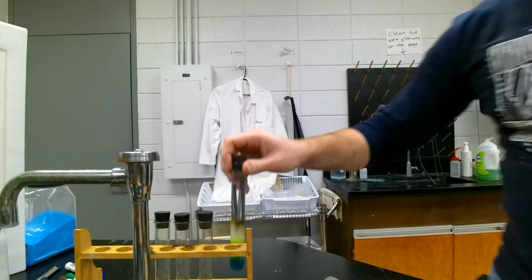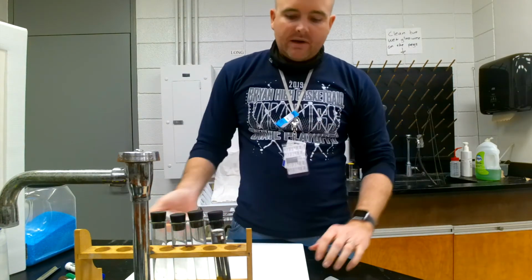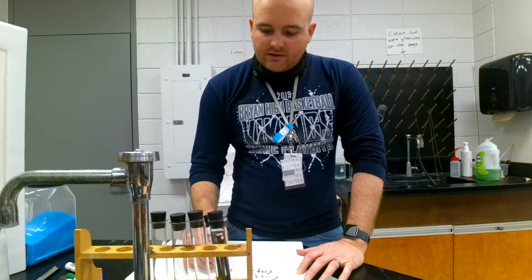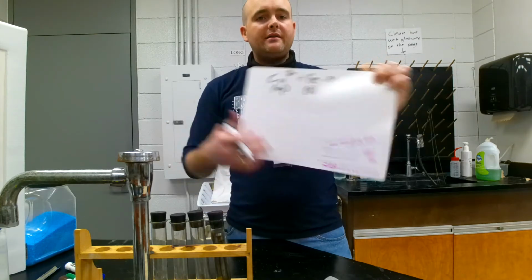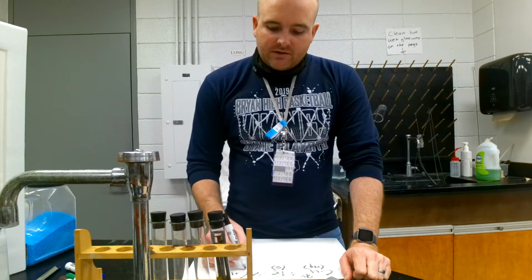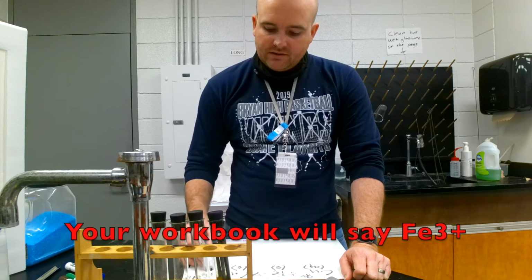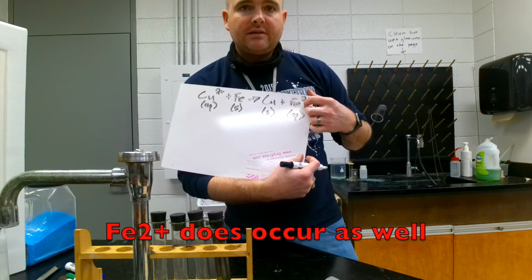So now let me throw in one little tidbit here. Your reaction that we obviously saw a chemical reaction. We saw copper 2 plus in the aqueous state, and we had iron as a solid here. Okay, those are the two things we were focusing on. There is a sulfate there, but we're going to omit it. Now what you're finding is that brownish color is going to be your solid, as your copper solid, and we're finding iron, probably iron 2 plus as aqueous. Okay, so that rust right there, that iron 2 plus, that's the rust.